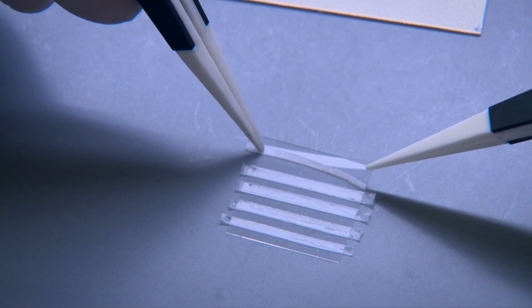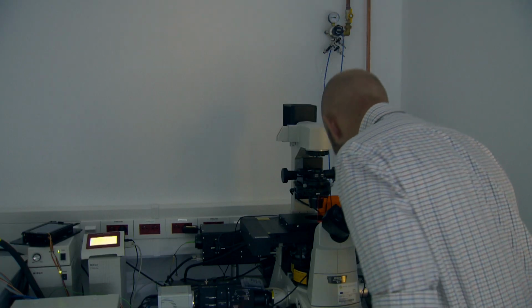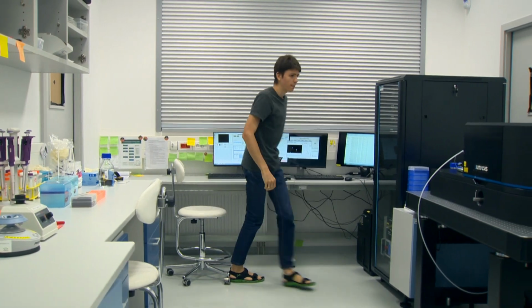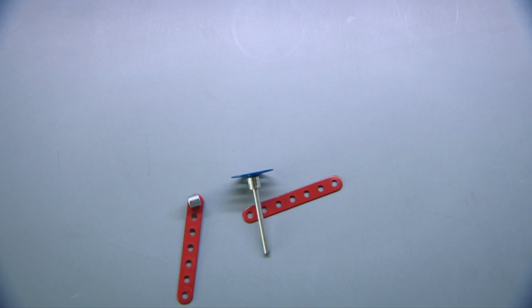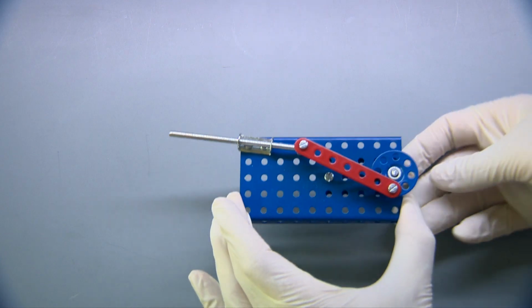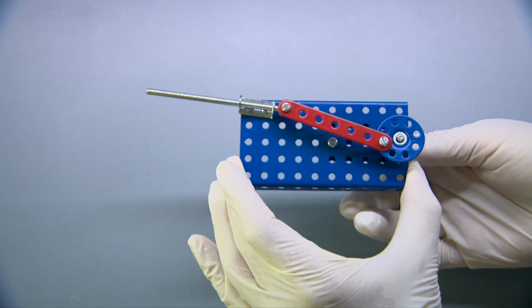In our lab, we use a combination of biology and physics approaches to answer this question. We use a bottom-up approach, assembling molecular machines from scratch. We isolate the individual proteins from cells and combine them to build functional units composed of only the essential proteins.